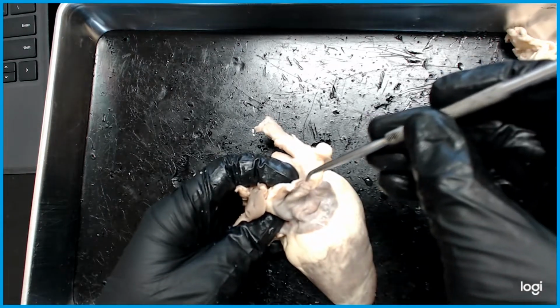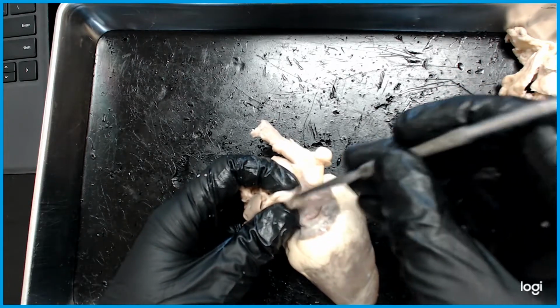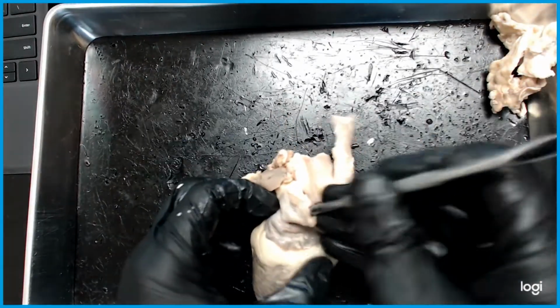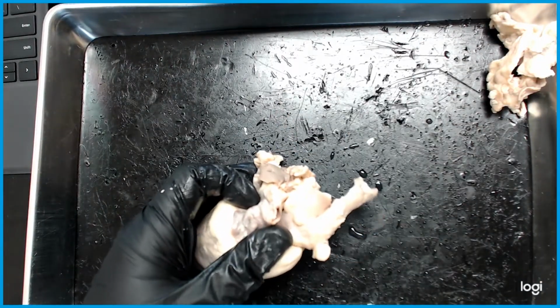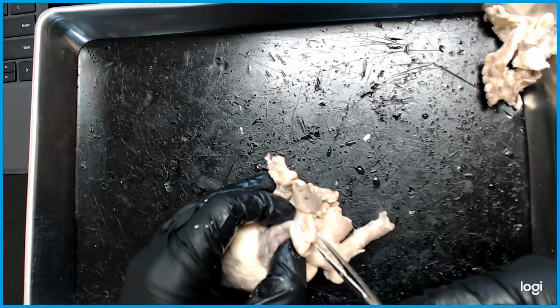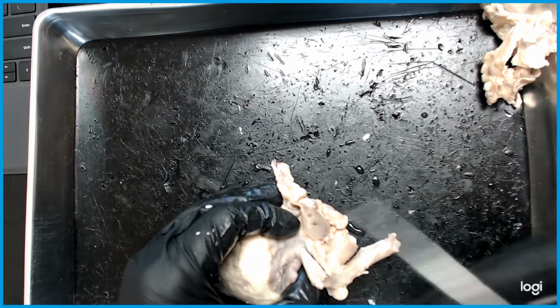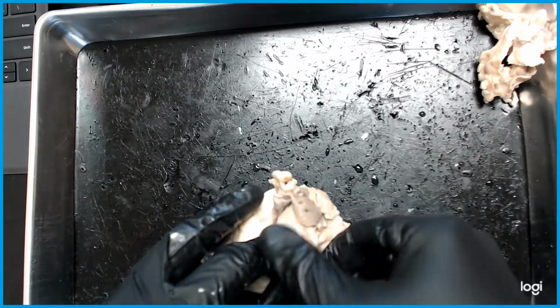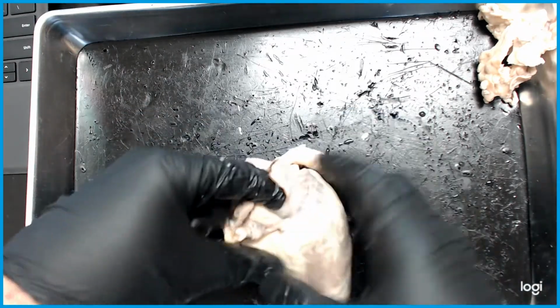In this case, our vessel is pretty small because we're not that close to it. And what I'm going to do is cut it open so I can put my finger in there. So let's go ahead and separate that section. In fact, I'm not going to just cut it off. Let's go ahead and dissect it like a little butterfly. So as I start opening up, my finger should be able to start fitting in there.